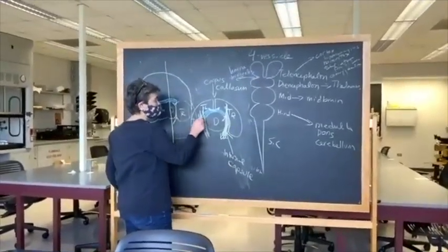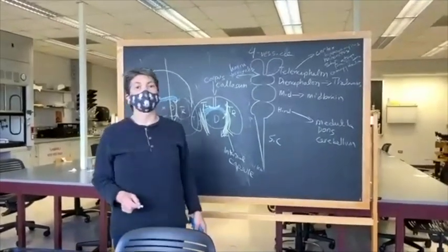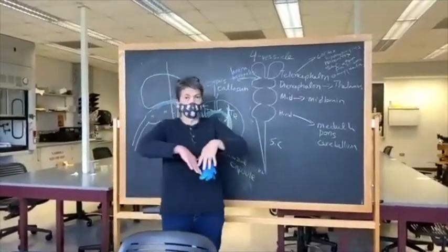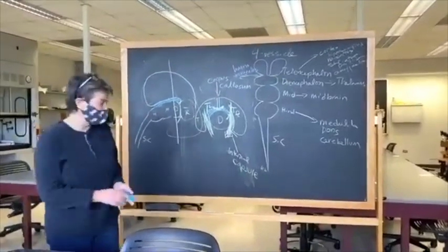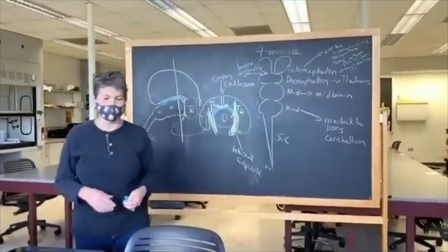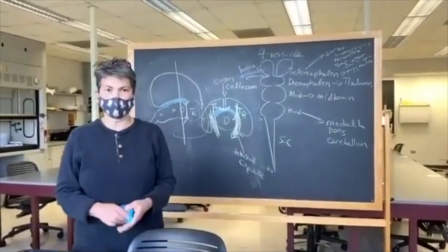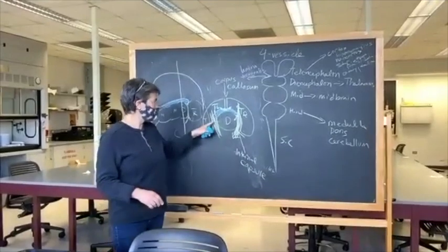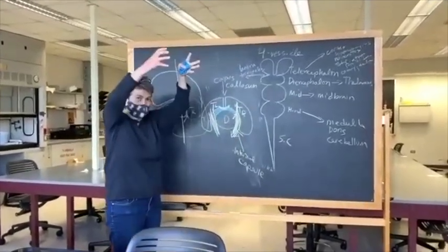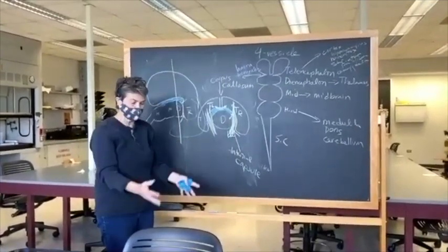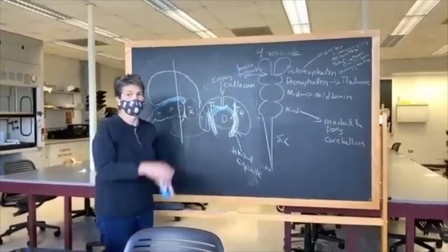You can actually take the entire telencephalon cap off — I have done this in the past. You take it off and what you'll see below is the diencephalon, midbrain, and hindbrain, all lined up.